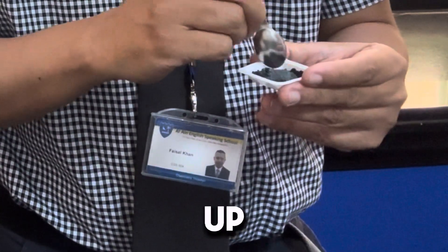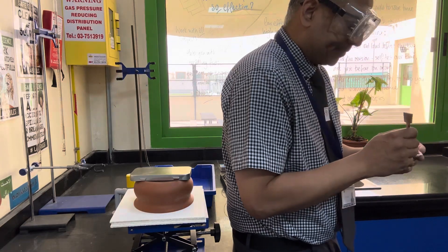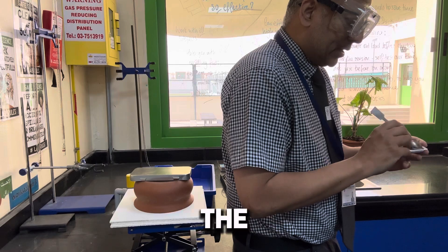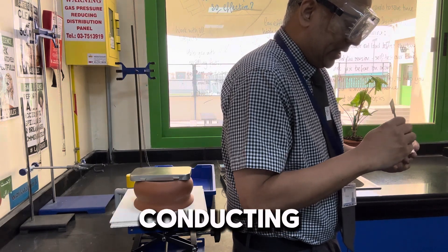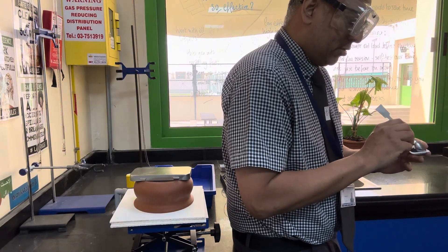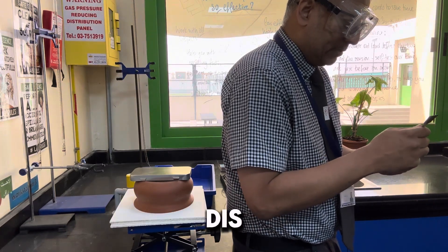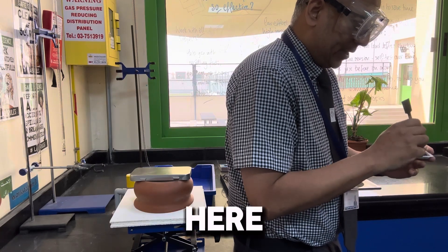Just start to mix it up here. And can you remember the type of reaction that we're going to be conducting? What's the big name for it? Displacement. So it's like a competition reaction, and it's a specific one — it's a displacement reaction.